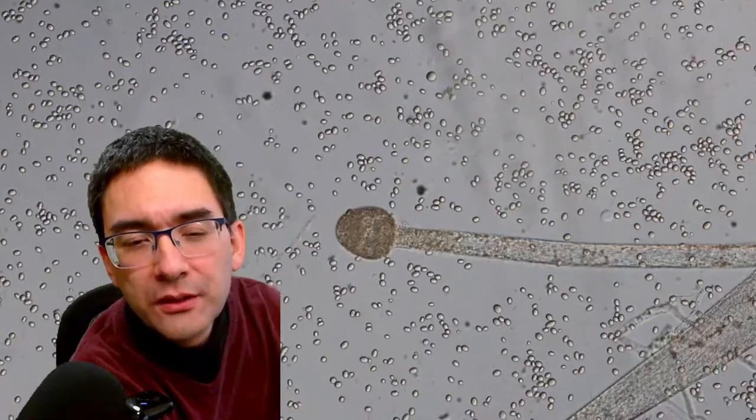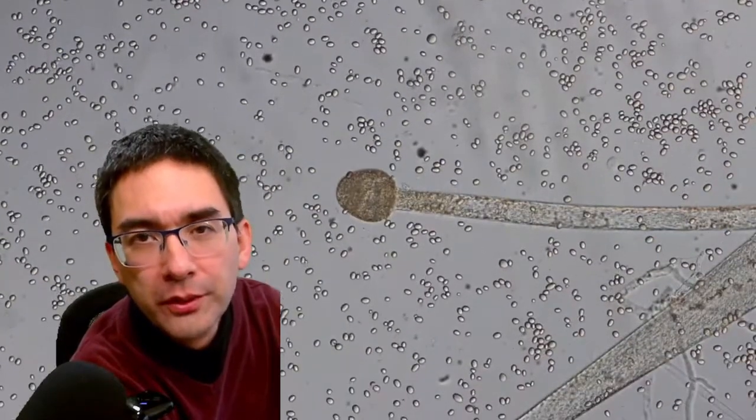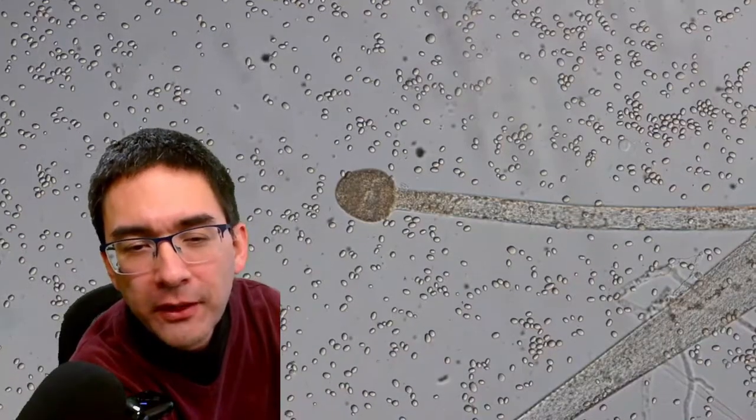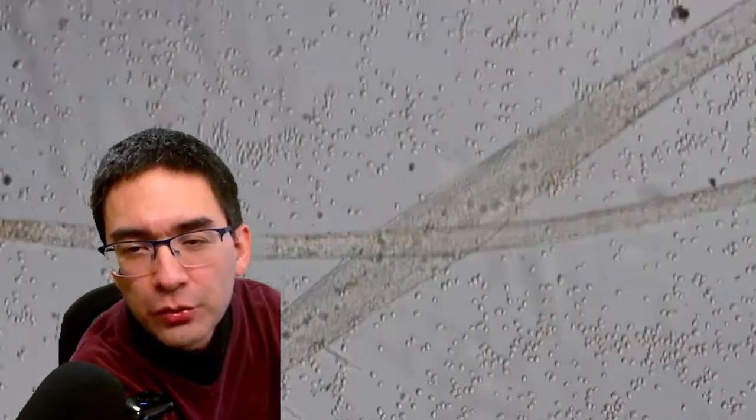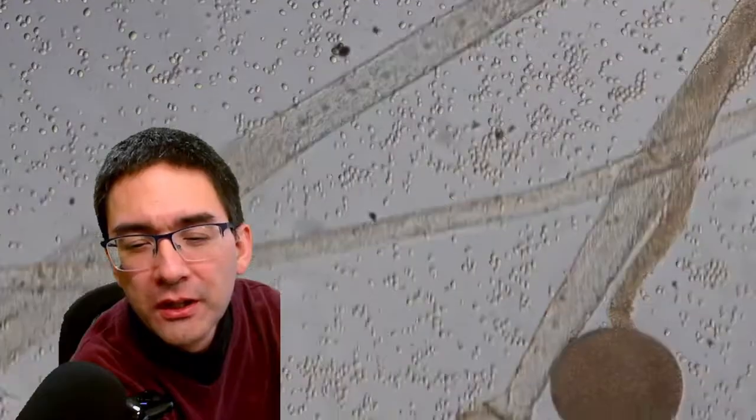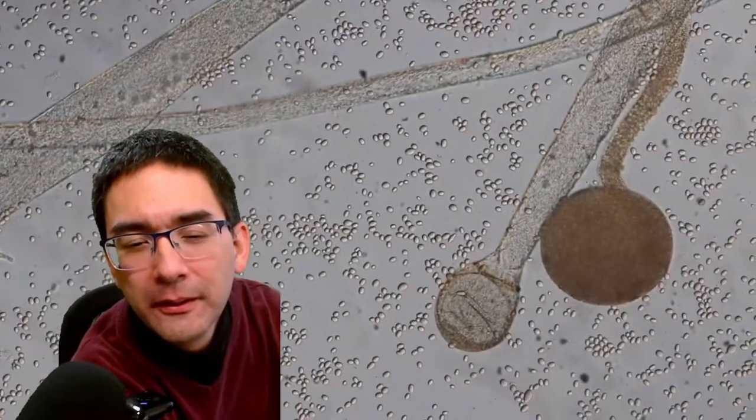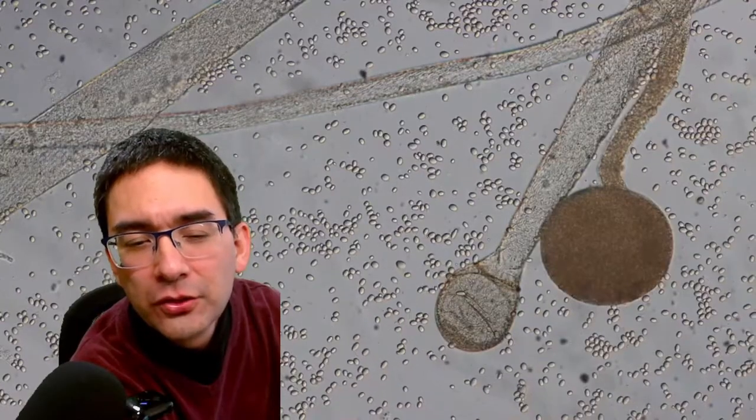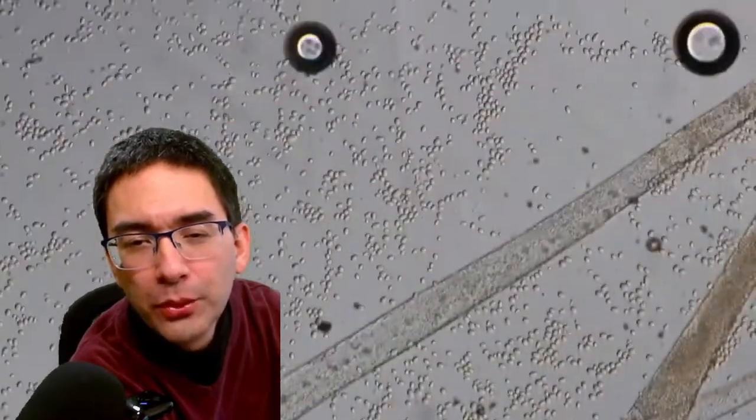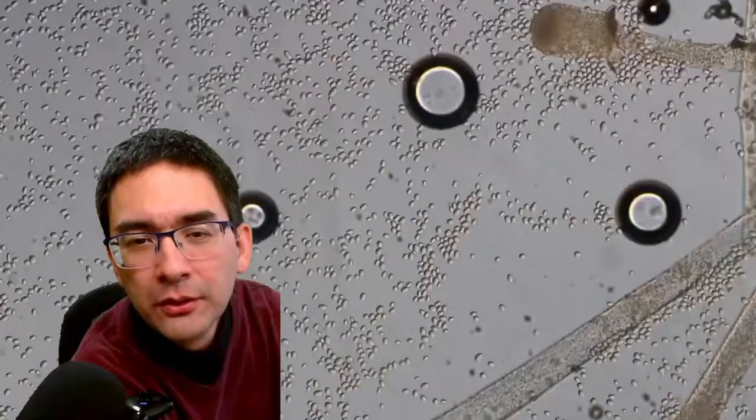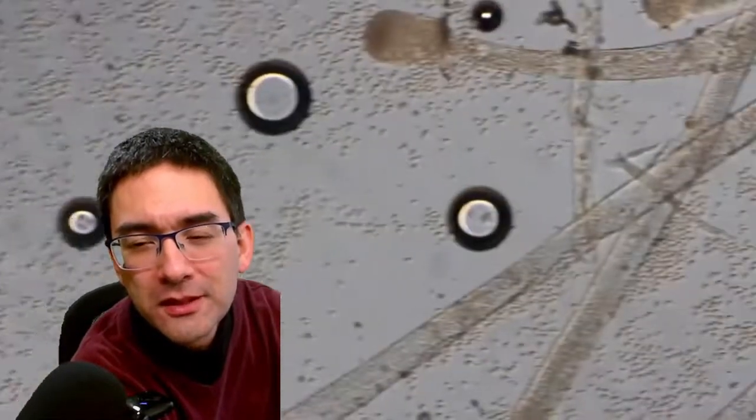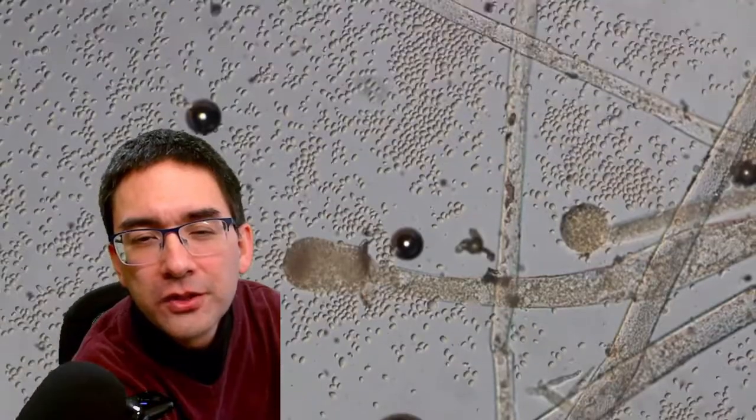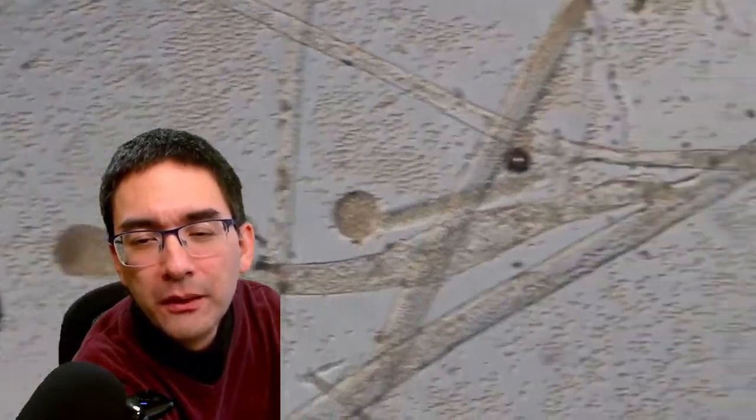So the fruiting bodies of a fungus, that's usually the mushroom. And the sporangia can be found inside the fruiting bodies. And these are the structures that actually make those spores. Here is a big one. Look at this. Lots of those round oval structures, of course, are the spores. Those big round structures here, these are air bubbles. Very nice. Lots of spores, thousands of them, millions of them maybe.